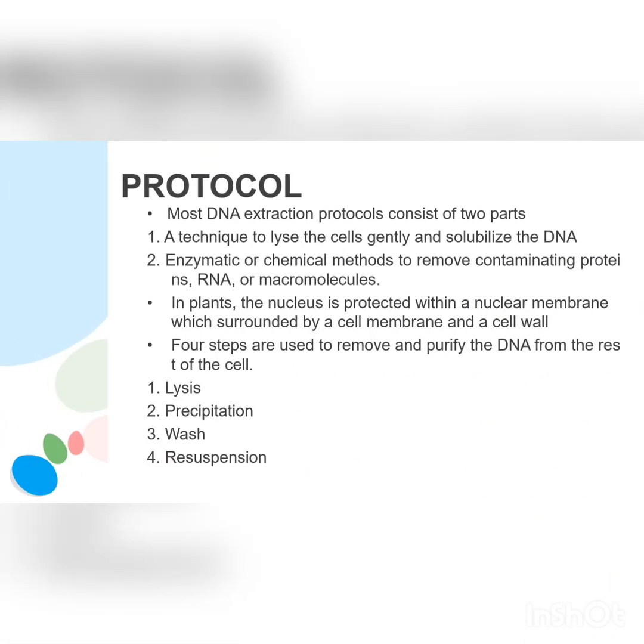Now, let's discuss the protocol for the extraction and purification of DNA. Most of the DNA extraction protocols consist of two parts. One is a technique to lyse the cells gently and solubilize the DNA. The second one is an enzymatic or chemical method to remove contaminating proteins, RNA or macromolecules.